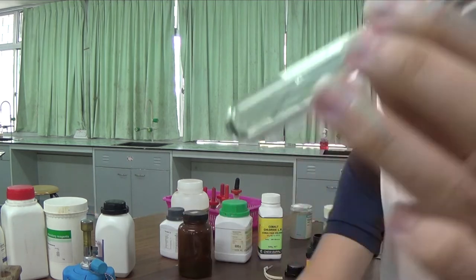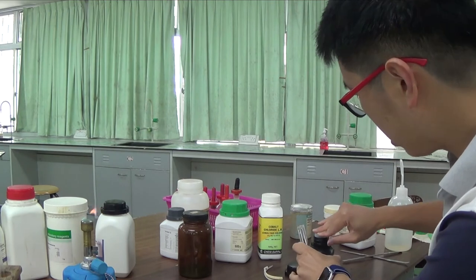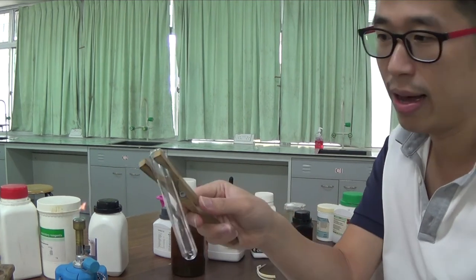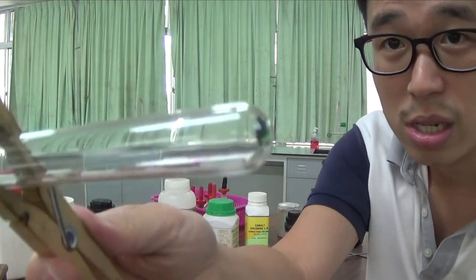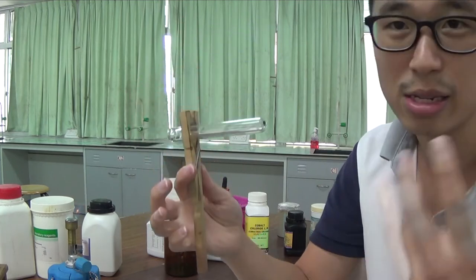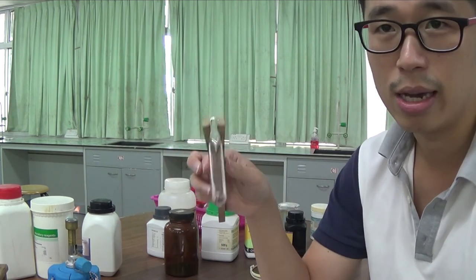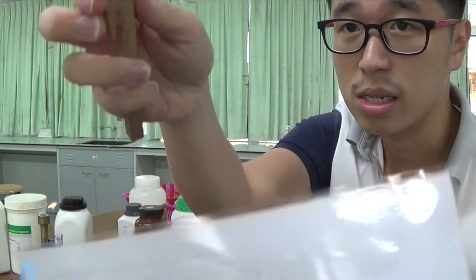So chromium 3 chloride, as you can see, it's green in color. So the solid is supposed to be nice crystalline, but because of the humidity, humidity is to do with moisture in the air, as well as my test tube holder is not very good now. You see it's sticking to the side now, because it doesn't want to stay crystalline unlike the other hydrated salt very easily, because of the hot and humid weather here in Brunei, where I'm based, but it should show you the effect anyway. This is a hydrated salt.